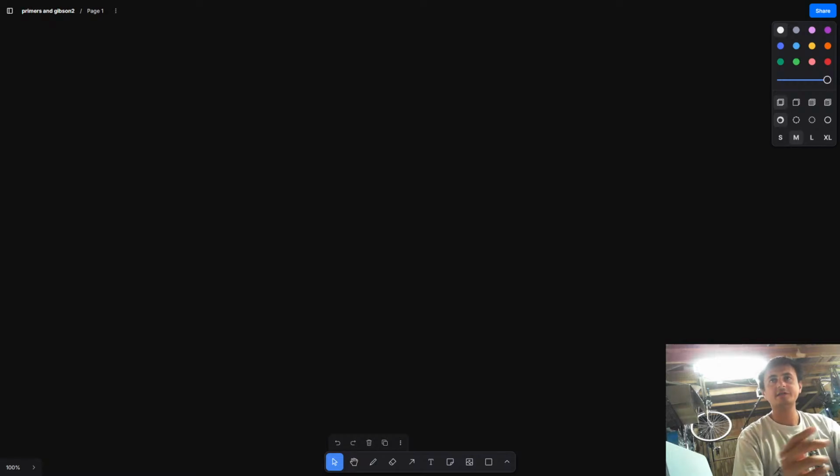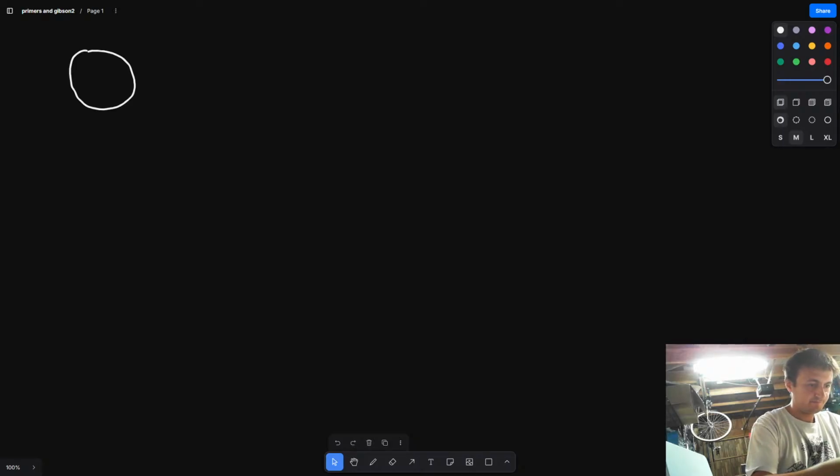Okay, so I think I got this wrong earlier. I worked it out again on a whiteboard, and what we're going to go over is basically, let's say that we have a plasmid. Okay, this is a plasmid.